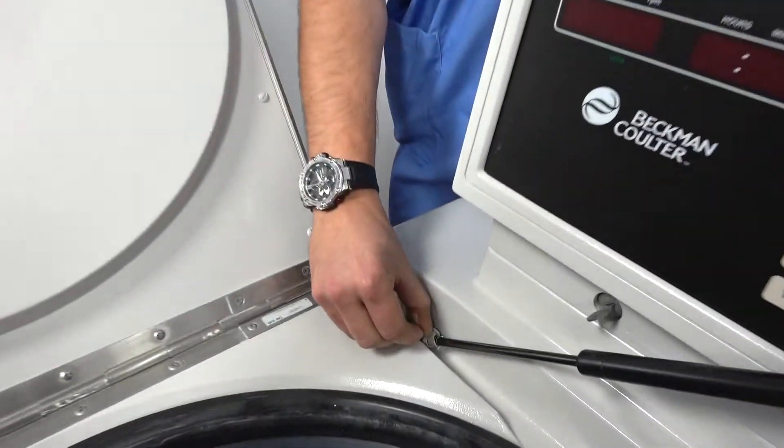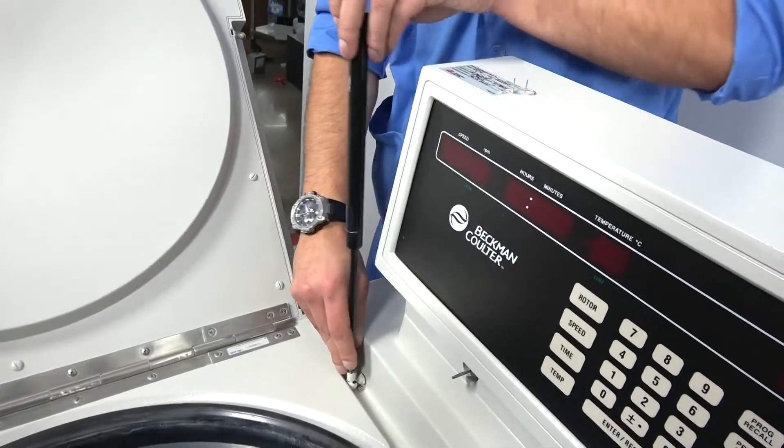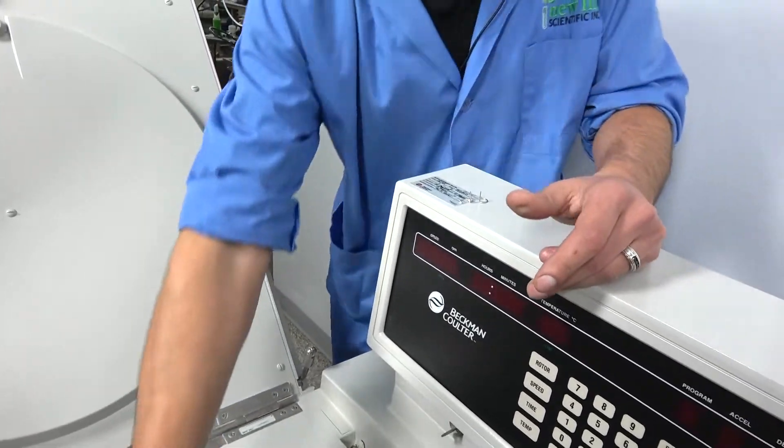Then you just take the bottom one off too. Pull it up. Save that one and then take it off and there's your old gas spring.